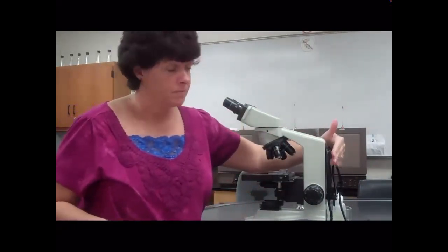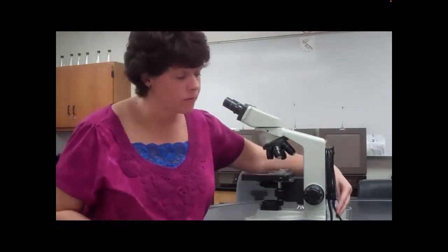When you put it in the cabinet, the lens side goes in first. The cord will be facing you. Always put it back in the spot with the number that is the same number as the number on your microscope.